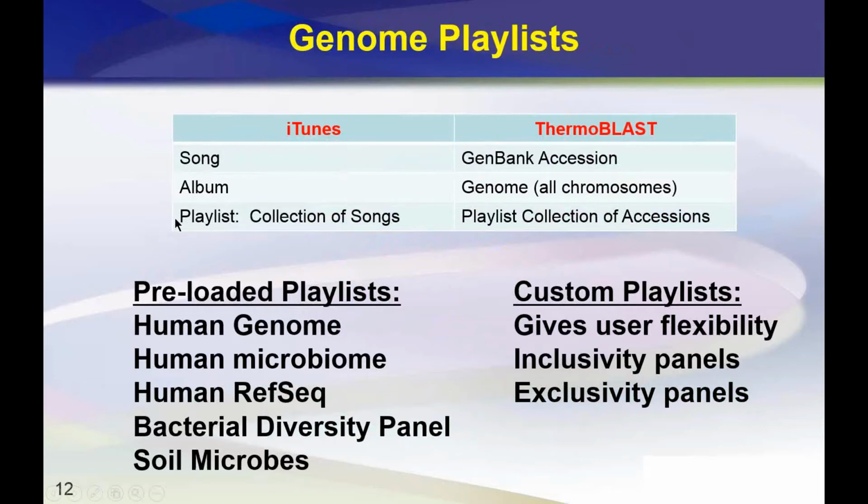And lastly is the concept of a playlist in iTunes, which is a collection of songs and a collection of albums. So we similarly have a collection of such accessions or other playlists that we can make in ThermoBLAST. And we'll see why that's valuable.